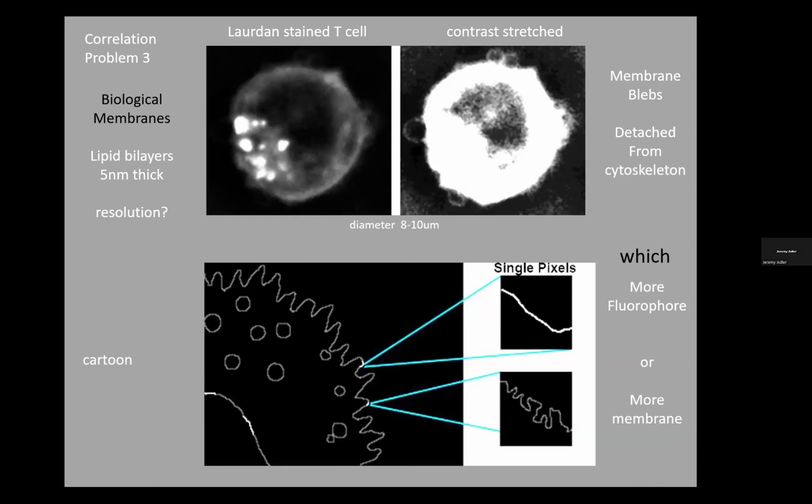These are membranes under tension, so they're very thin and stretched. Here we have probably bits of plasma membrane that have much higher intensities. In this image, we can't even see the blebs, but we can see something that gives us a clue about the plasma membrane intensity. So the question then is, why is the plasma membrane here very intense, but here is much less intense?